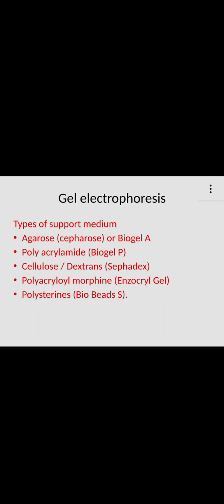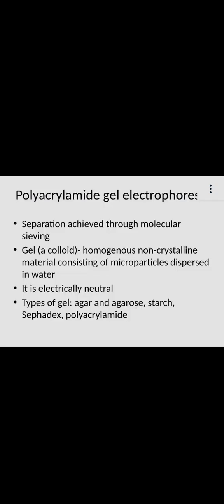So as we mentioned when we were discussing the types, gel electrophoresis comprises several types depending on the medium that is used for separation. So our main interest is PAGE, polyacrylamide gel electrophoresis.